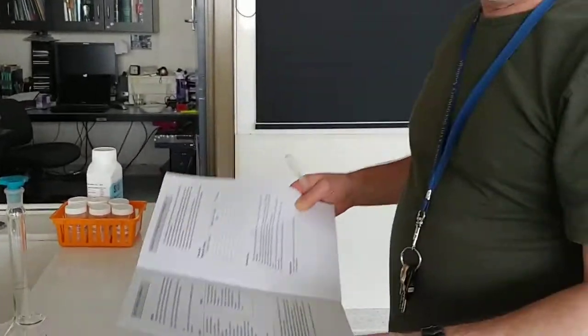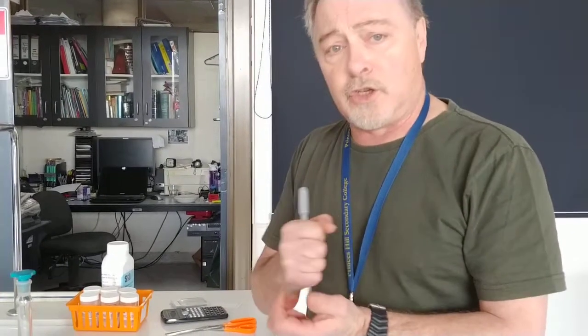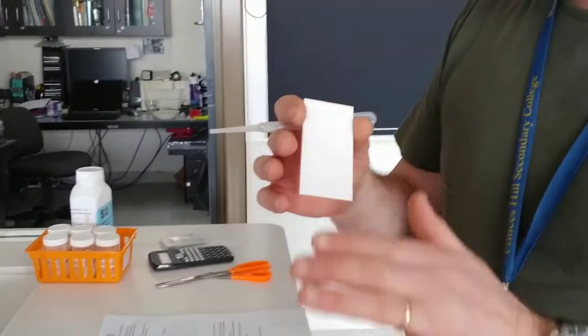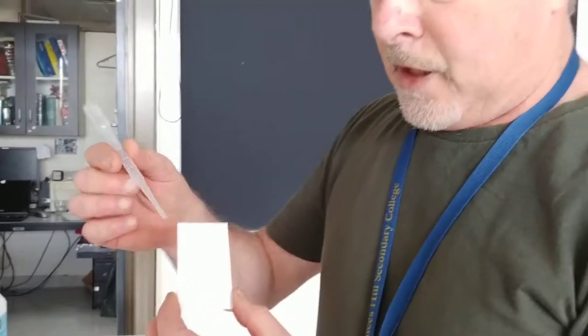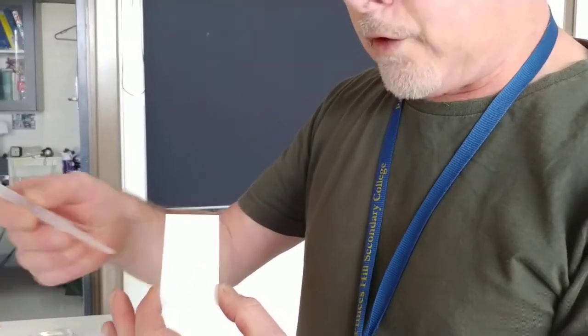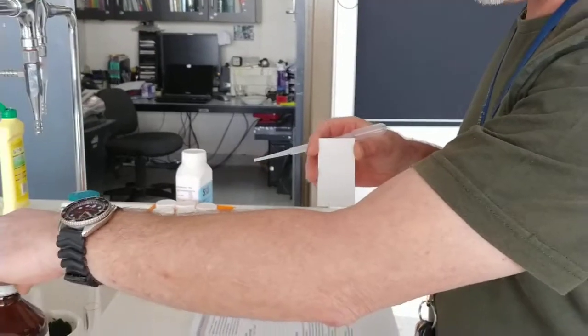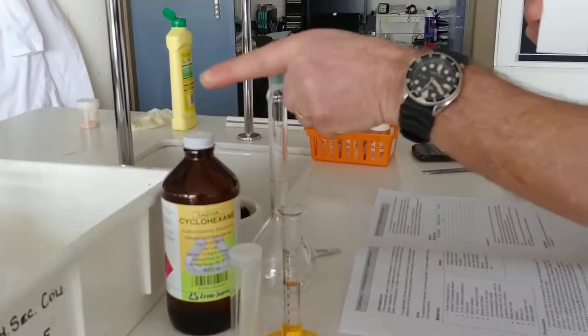And what we're going to do is place it into a mortar and pestle, put some acetone in there, grind it up, and get that juice coming out of the plant. The acetone will dissolve a lot of that stuff and put it into solution, and then we're going to transport that onto a plate. This is called a thin layer chromatography plate. It's a very thin aluminium plate with a ceramic coating on it, and what happens is we put some drops along here. We'll go through that process in a second, and then we put it into a beaker containing a 1-to-1 mixture of cyclohexane and acetone.